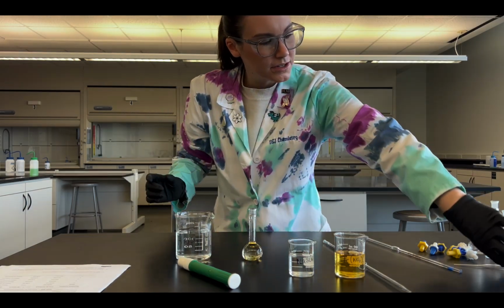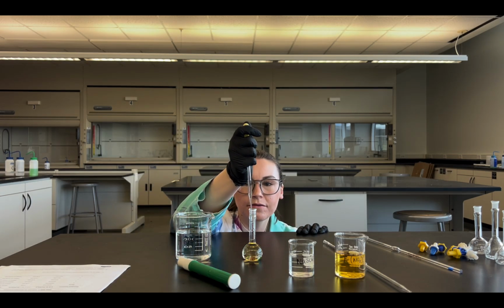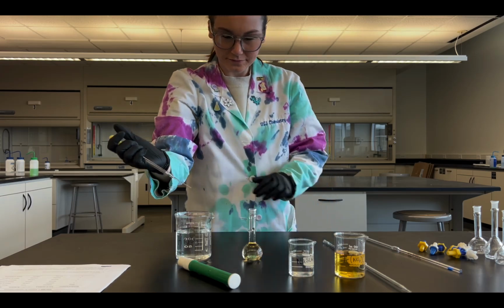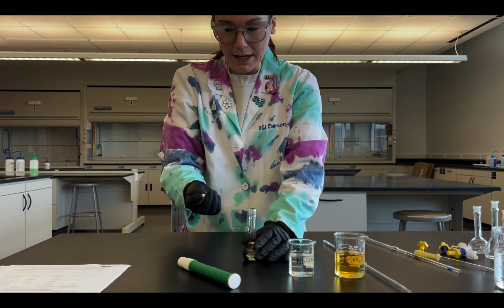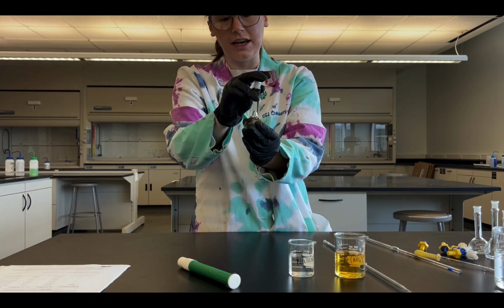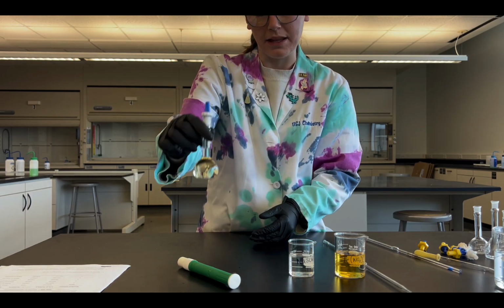Okay, so now I'm just gonna take my pipette, I'm gonna get on eye level. There we go. So in my flask right now, I have exactly 25 milliliters of my blank solution. I'm then just gonna put a cap on it, flip it upside down a couple of times so that it mixes together. And that's my first solution of my blank.